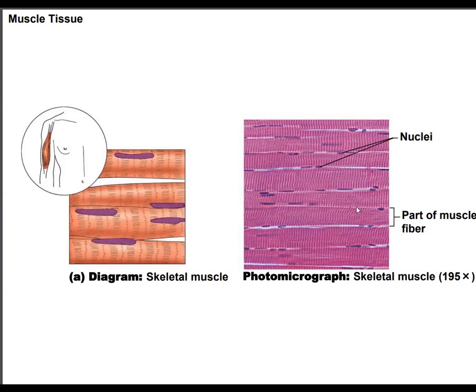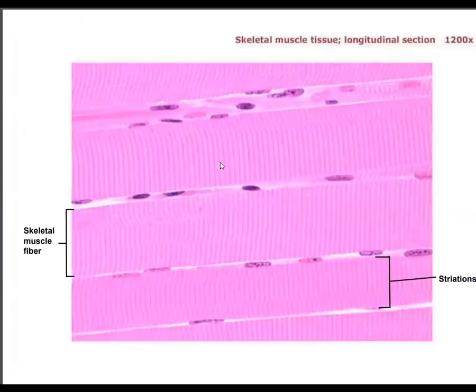So this big tissue category is muscle tissue. This specific tissue is skeletal muscle. This is what it looks like underneath the microscope. So again, big, thick fibers with the tiger striping called striations. So this specific tissue is skeletal muscle, and this big tissue category is muscle tissue.